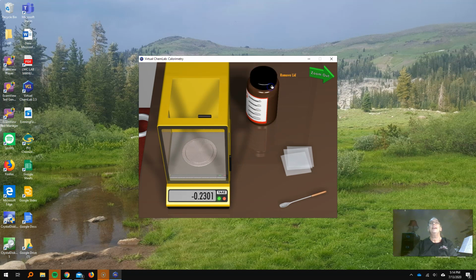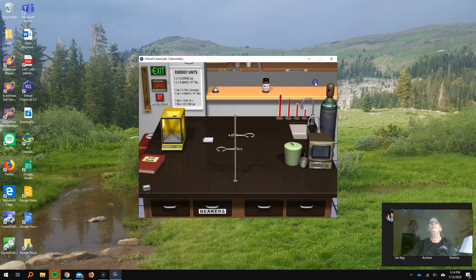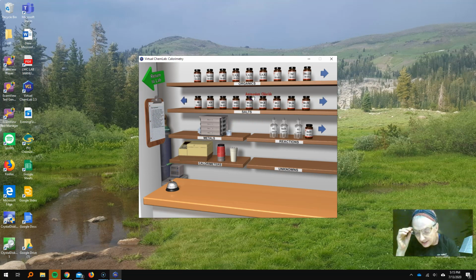Alright, put this guy away. There we go. Put you away. Okay, what's my next one? C6H5OH, which is phenol, so that's an organic. So let's look in our organic section here. Oh, keep going. Oh, it's a liquid, so it's going to be in these containers.